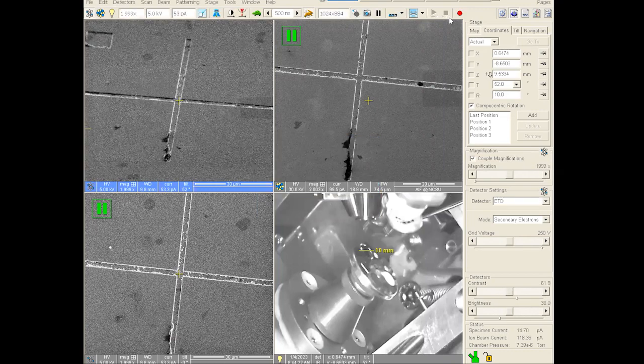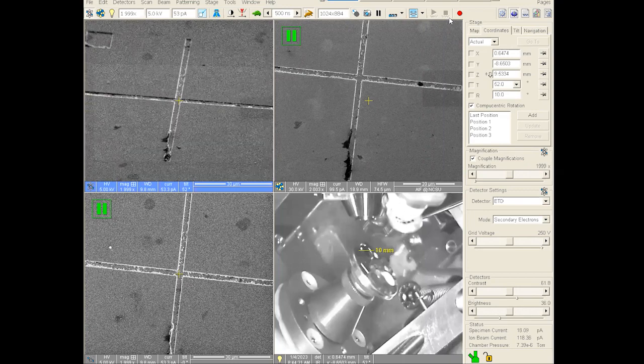So most of the time it will actually work. I would say 99% of the time. If for some reason it's not working, usually your contrast is too high or too low. Adjust your contrast a little bit and then try it again.